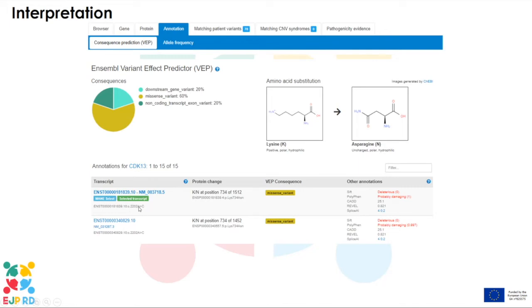What you'll notice here is that we also tag MANE Select transcripts. So MANE is a project between EMBL-EBI and NCBI, and all of these transcripts match the Ensembl transcript as well as RefSeq. They match the genome build 38 genome, and they're a primary reporting transcript.